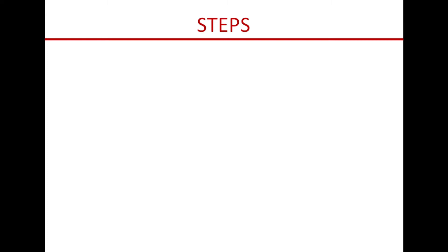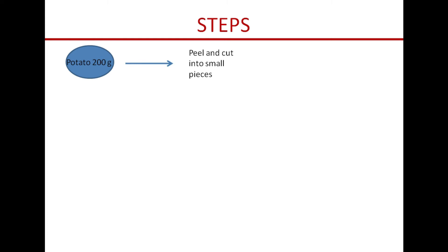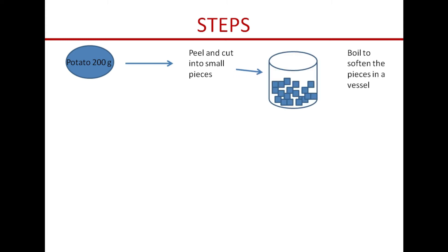Now, what are the steps in making PDA medium? This is one of the first media that a plant pathologist prepares during their learning years. We take 200 gram of potato, peel and cut them into small pieces, then take distilled water and boil the potato pieces in a vessel until they become soft.